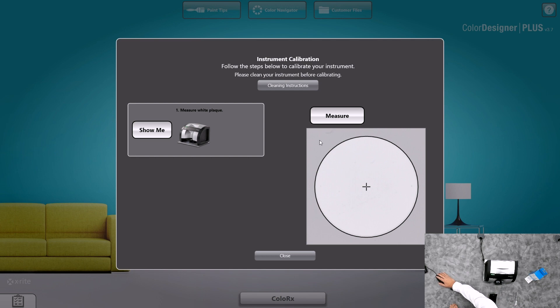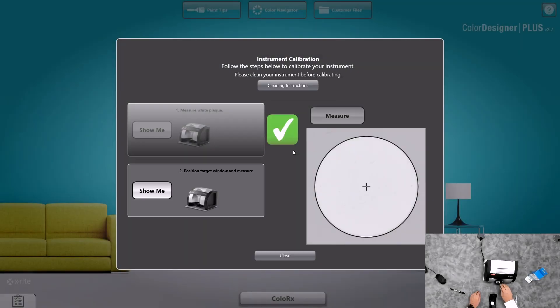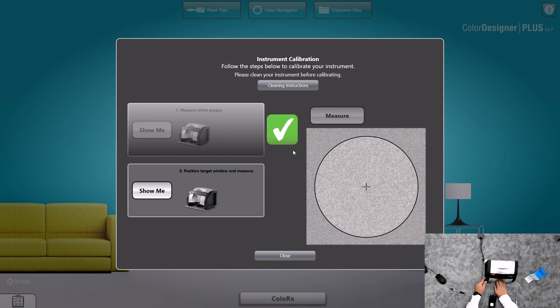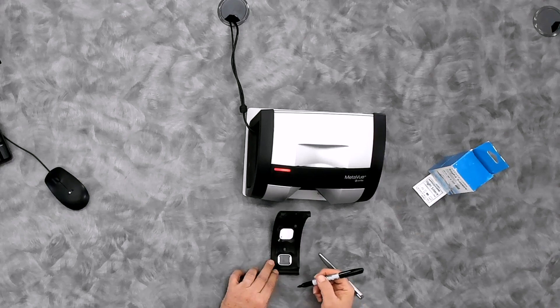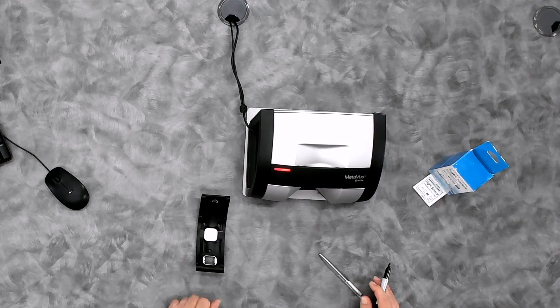I'll simply show how that calibration works again. In the same technique, when we go to do the calibration square or target square, the same thing is important there. You'll notice my square here has two tabs — what I call the left and right. Those tabs are indicators for the camera to find that the target square is in place. So if you were calibrating and happened to have a paint splash or something on either one or both of these tabs, the illumination for the calibration of the target square will not work.